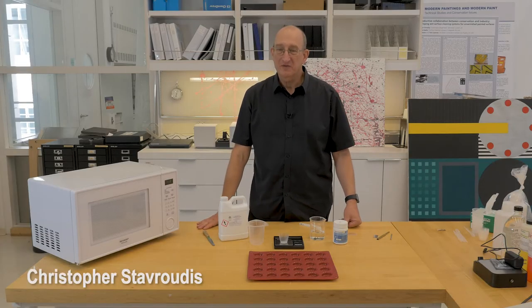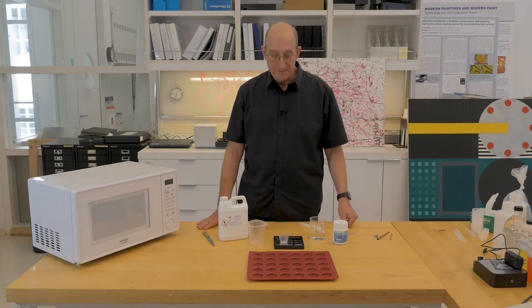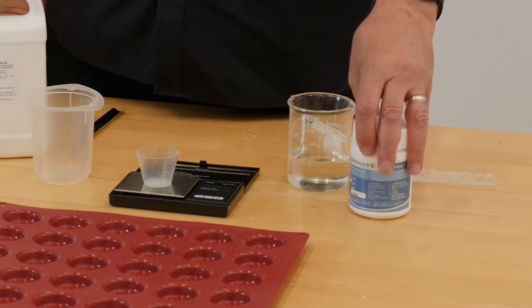We're going to make the agarose plugs to measure pH and conductivity of a surface of a work of art. We're going to use benchmark agarose, electrophoretic grade, so it's high purity, low conductivity.